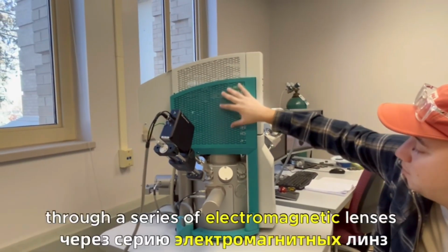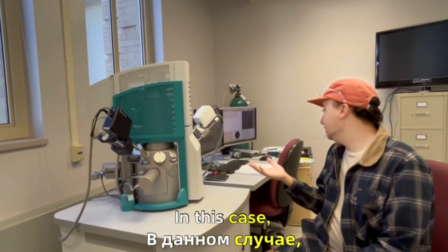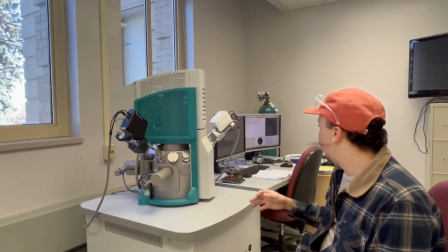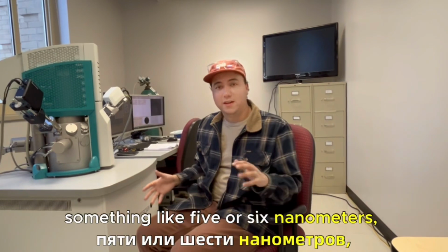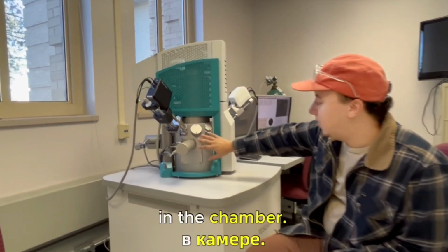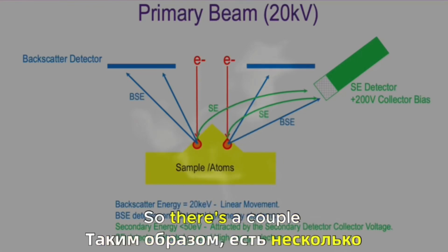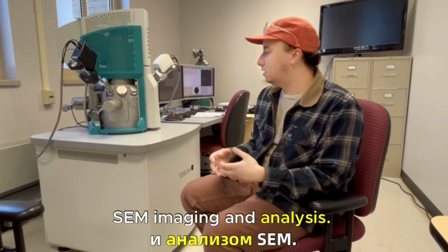Electrons. Those electrons are then funneled through a series of electromagnetic lenses and coils down to a beam. In this case, we're currently 600 nanometers across in our beam size. That's a fairly broad beam, but we're doing a fairly broad analysis. We don't need a super tight beam for that. But next door, we can go down to something like 5 or 6 nanometers pretty reliably. That beam is then focused to a point in the chamber. This actually opens and we can insert samples, and that beam then hits the surface of the sample. There are a couple of different physical interactions that we take advantage of with SEM imaging and analysis.